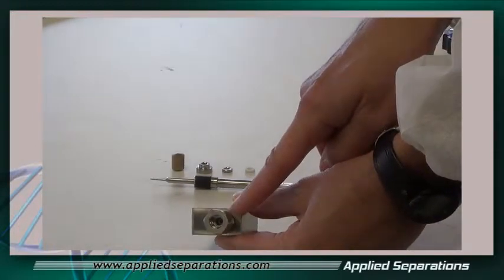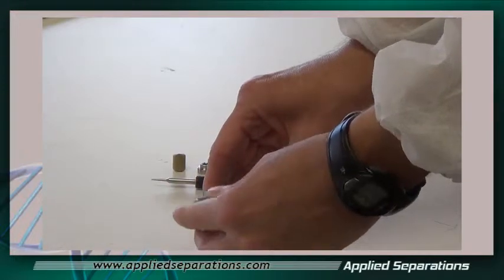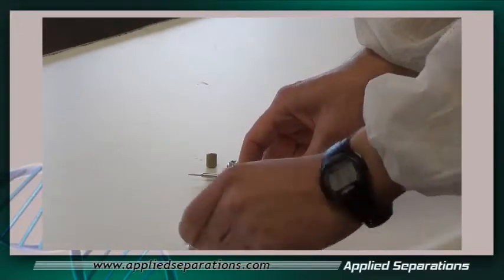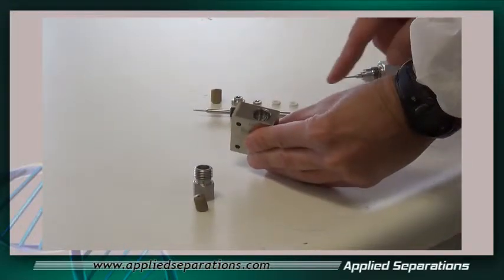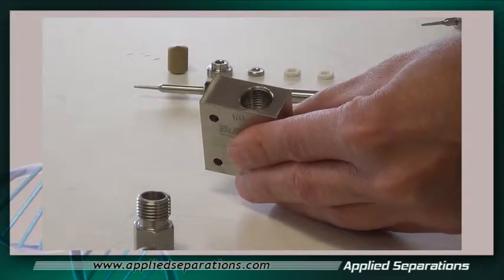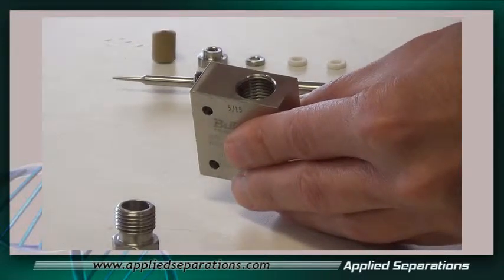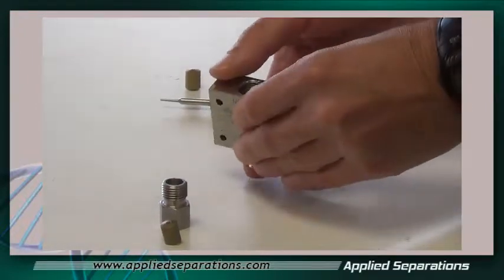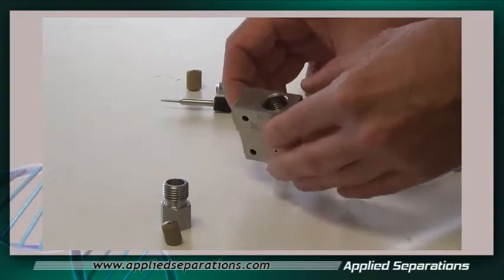We also need to remove the smaller bottom nut. Then we want to remove the old brass seat. Looking back in at the top of the valve, we want to remove all the small components: the small stainless steel washer and the small Teflon washers. You can use tweezers, a screwdriver, or some other tool. Come in from the opposite side and just push, and all three of those washers come out.